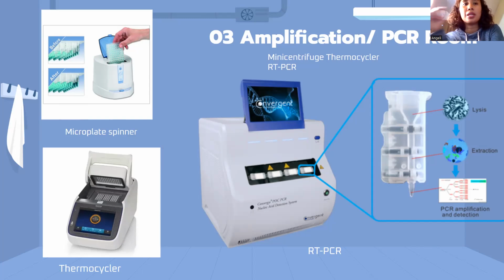Guys, please, this will come out in the quiz. What is the temperature of denaturation? Of annealing? Of elongation and all? This is RT-PCR, where the results come out right away, positive or negative for COVID-19, along with the number of cycles.